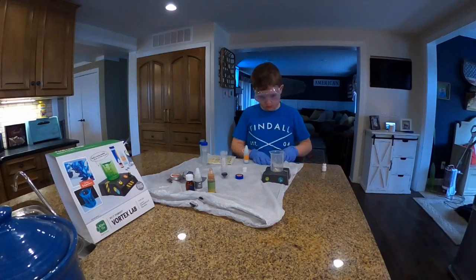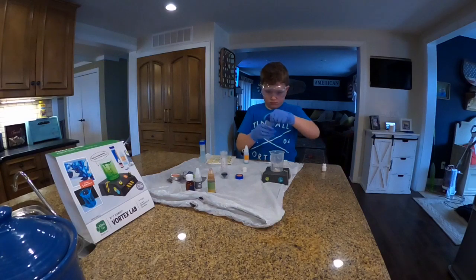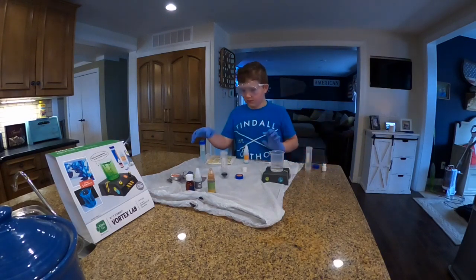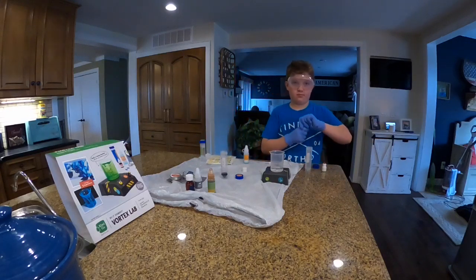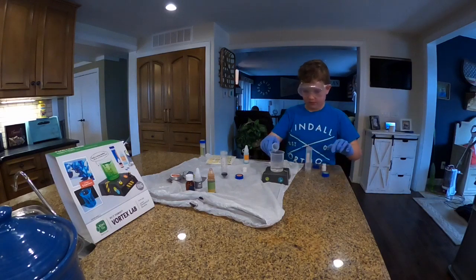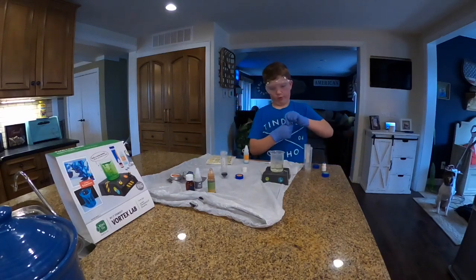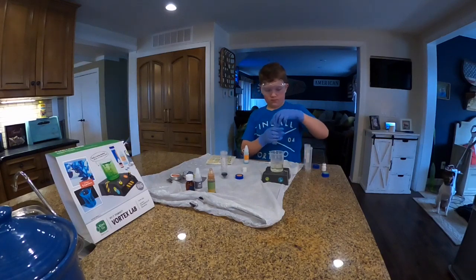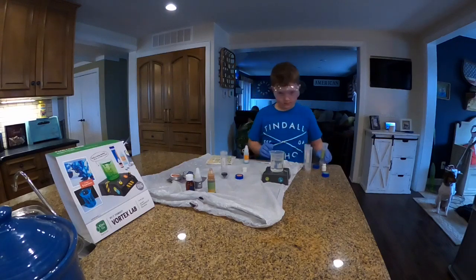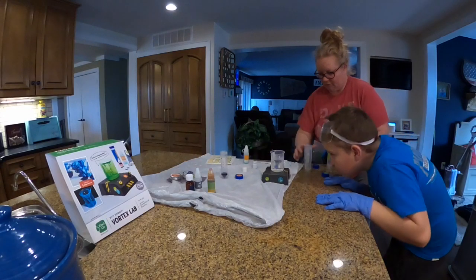Now it says with the mixing machine off, pour the test tubes into the beaker in this order: A, then B — is it like the alphabet? It's just A, B, C. It says not D. Did that change color? It looked like it was blue before. Now C. It looks like normal water now, it's looking yellowish. And it says it should have just over a hundred milliliters in there now. Yeah, just over a hundred.